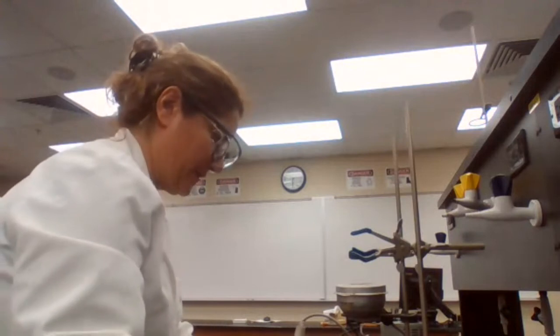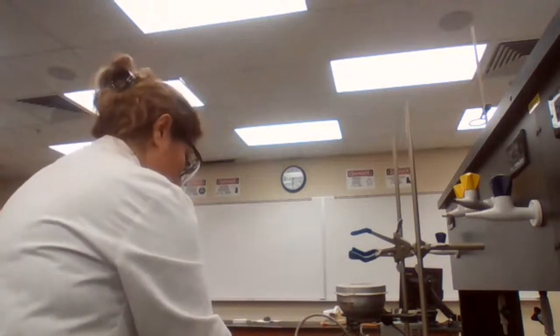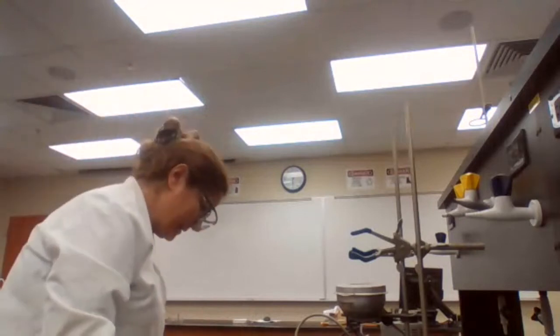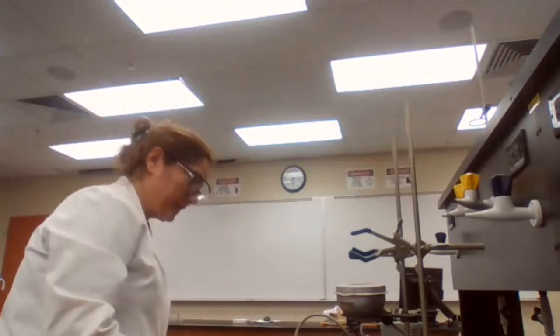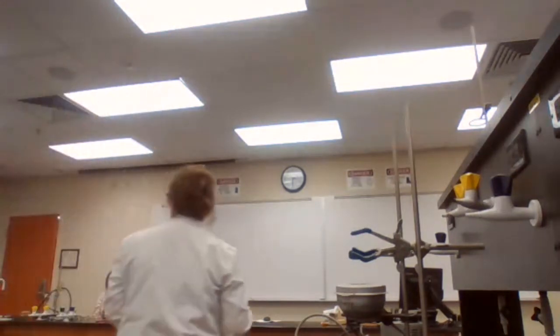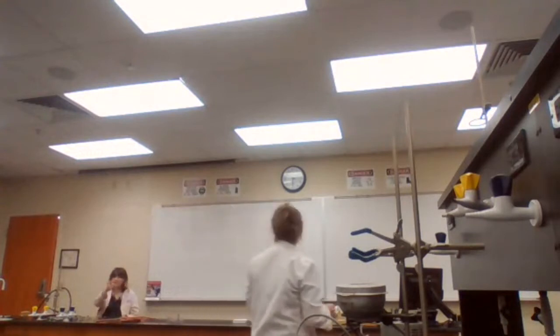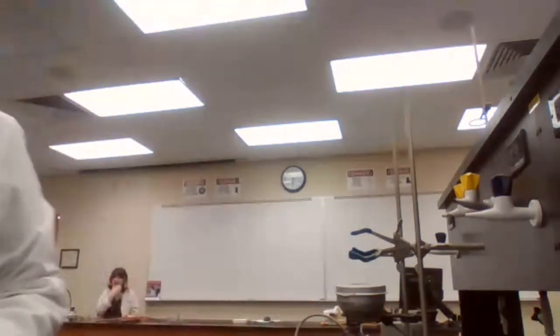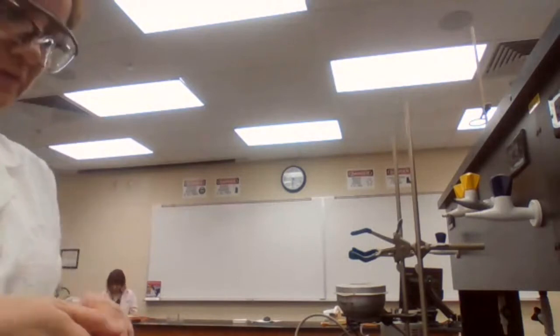So it would be nice if we had at least one drawer or two of these things complete. That's all right. The setup sheet didn't have the grease. The grease is there. Oh, perfect. Thank you.